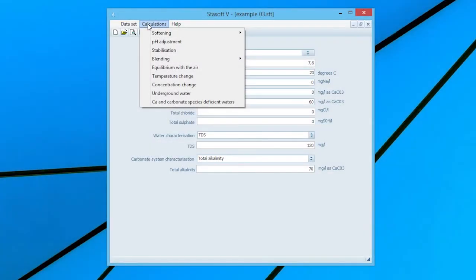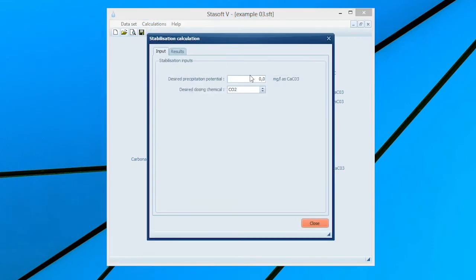Close the window and select the Stabilization option from the Calculations menu, bringing up the Stabilization Inputs window for the recarbonation of the present or active water. Enter the specified final calcium carbonate precipitation potential of 4 mg per litre as calcium carbonate into the desired precipitation potential input box and select the Lime option.